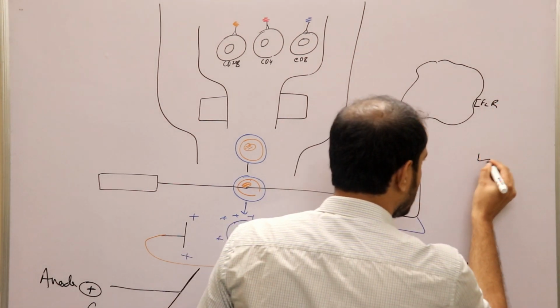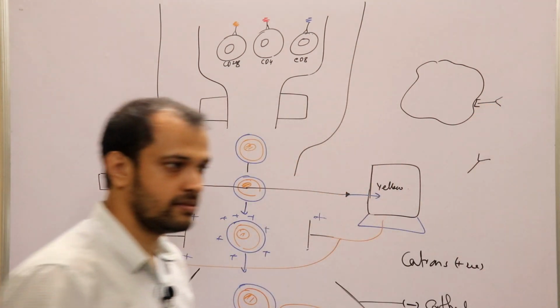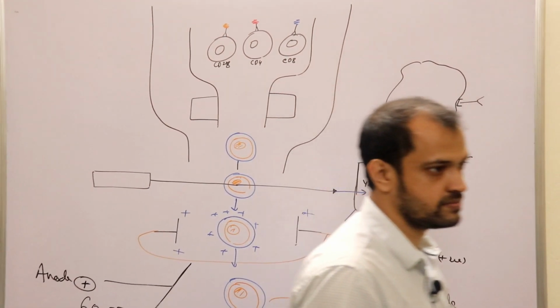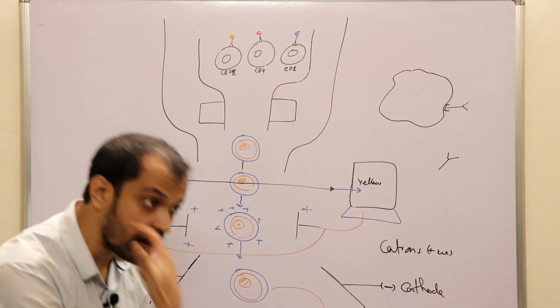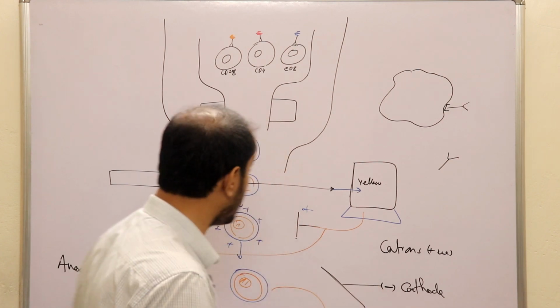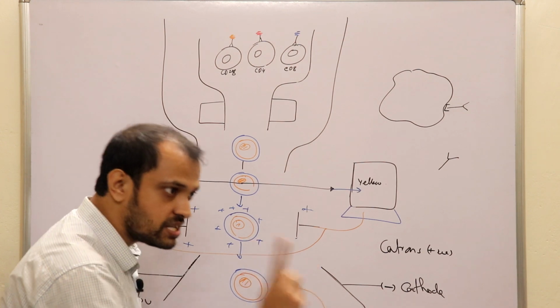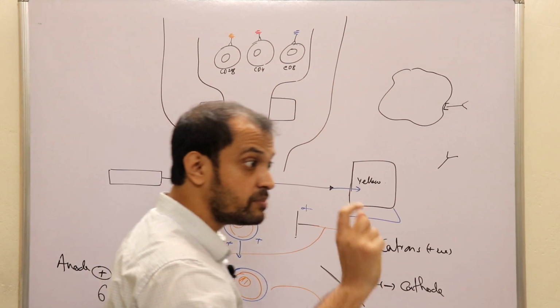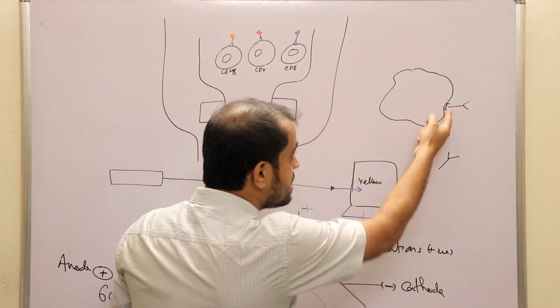That means if you add an antibody, the antibody will get attached here. So when you are asked to separate WBCs using cell sorters, you don't add the antibody tagged with a particular fluorophore first. The first step is to add an antibody against this FC receptor.